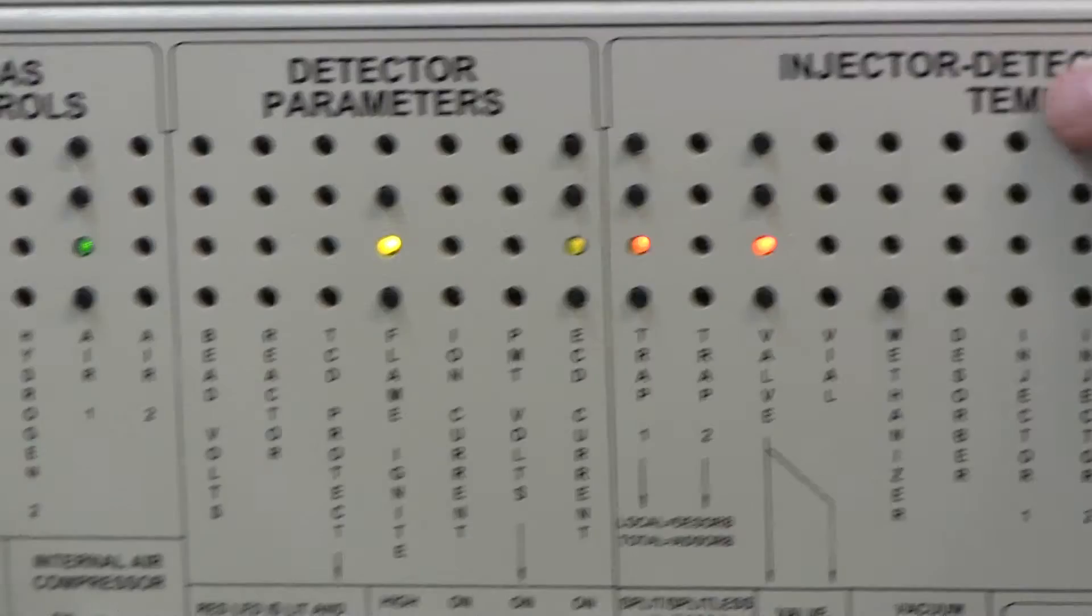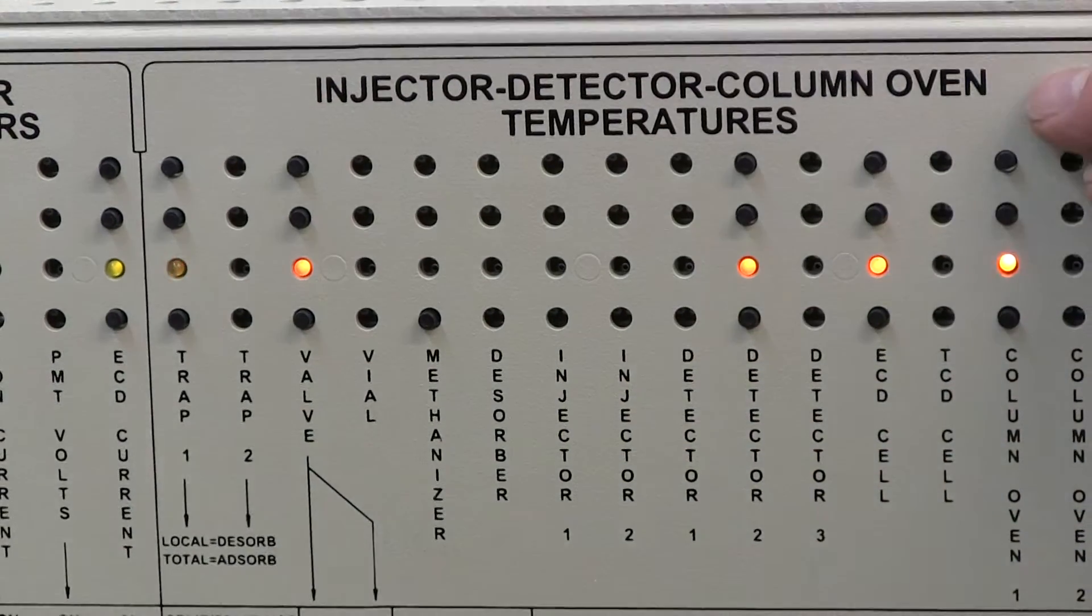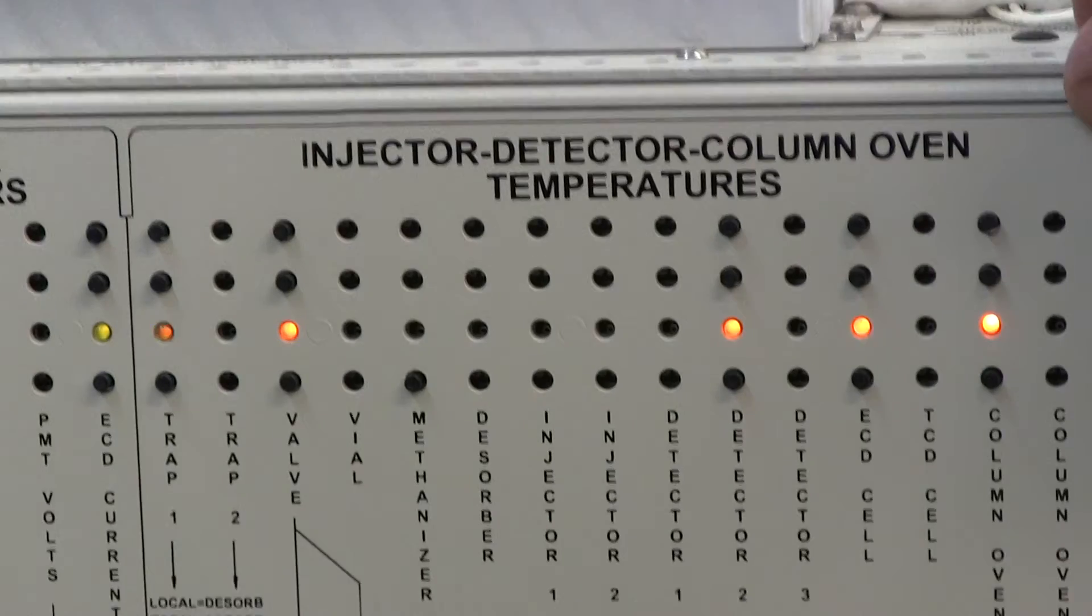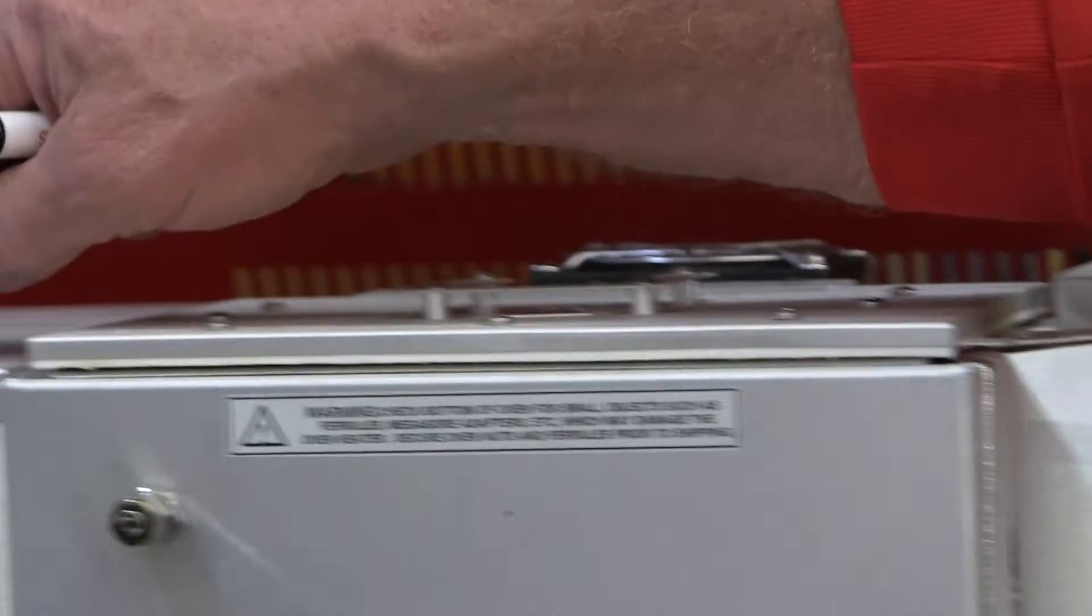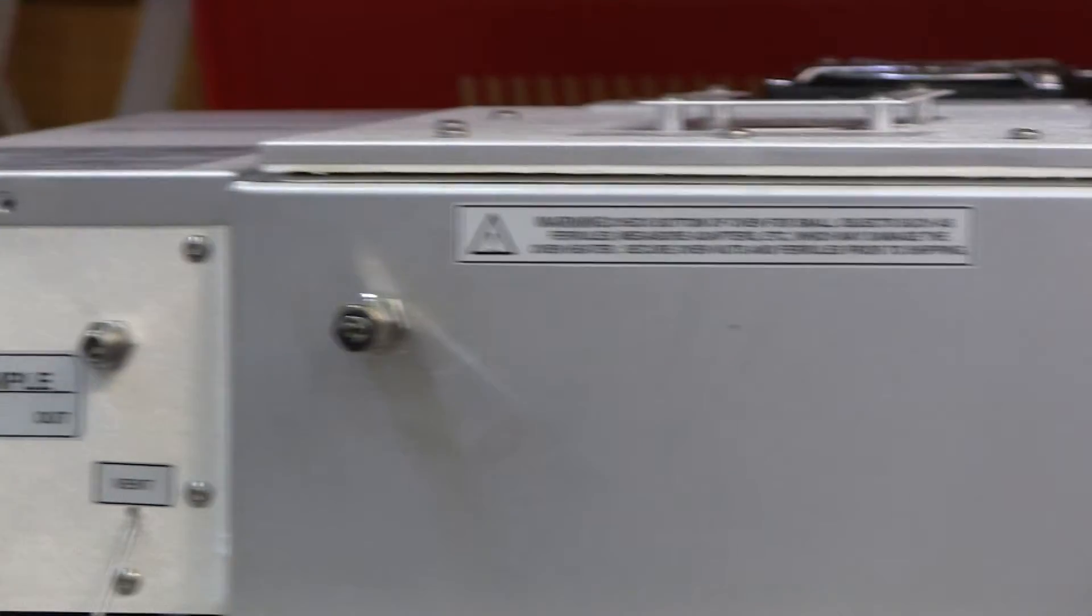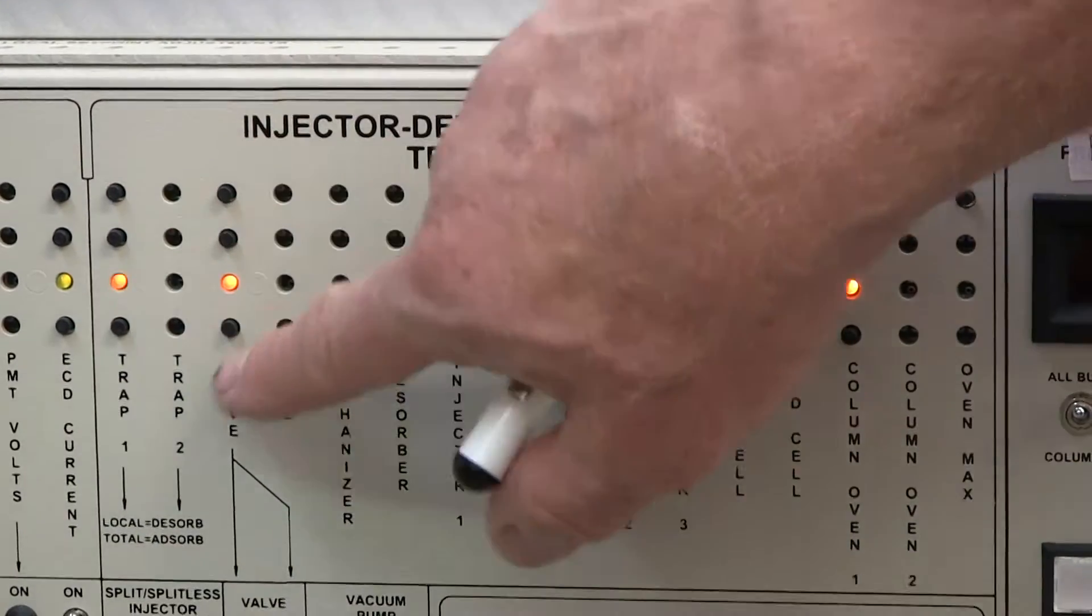Then we have the heaters. We can have up to 16 different heaters on a GC, depending on how the GC is configured. This particular GC has a column oven, an FID, an ECD, a valve, and a pre-concentrator. Each one of those things has some kind of heater control associated with it.